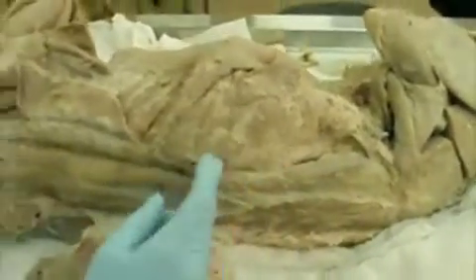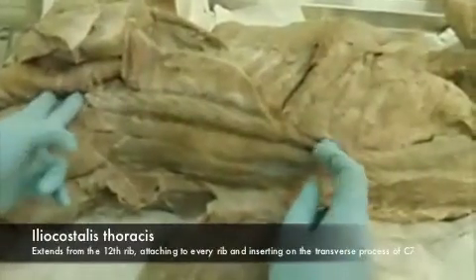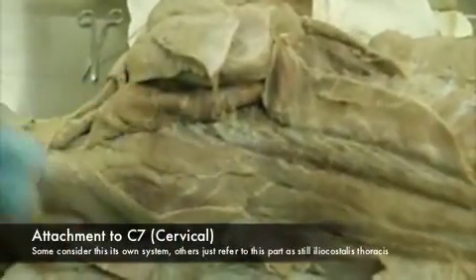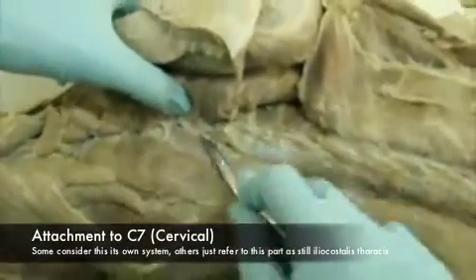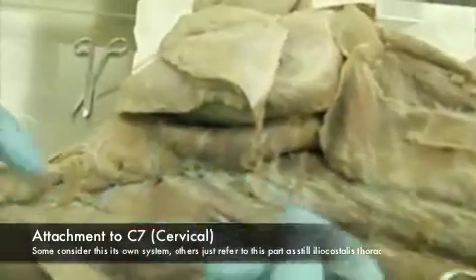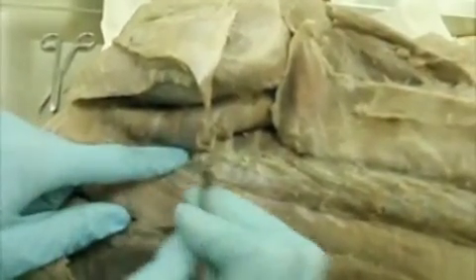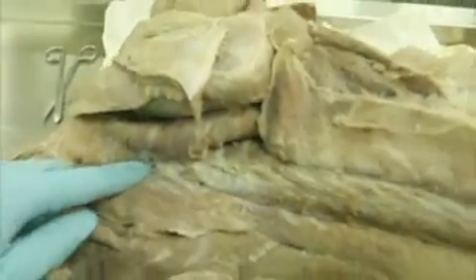Then when you get to the ribs, this is your thoracic part, iliocostalis thoracis, and then there's a tiny little spindle-shaped strand, which we can't really see, unfortunately, but it's one of these tiny little ones that go to the cervical vertebrae, and that's your cervicis. Unfortunately, I couldn't really find it in this specimen, but it's present. It's one of these tiny little spindle-shaped muscles that go to your cervical vertebrae.